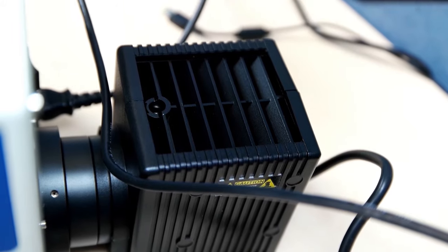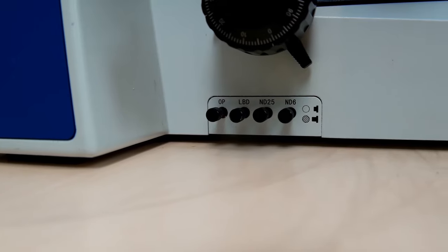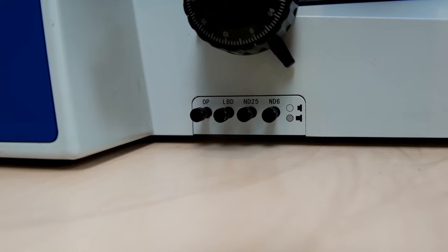For transmitted light, this microscope uses a 100 watt halogen. It comes with several neutral density or light balance filters.